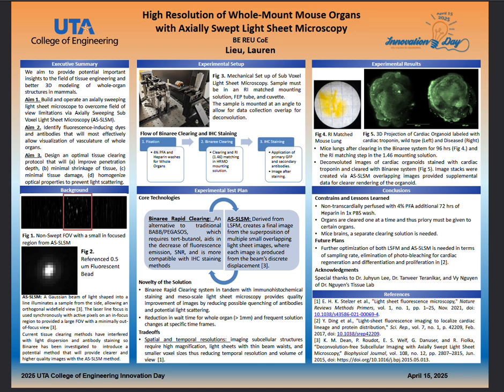Some trade-offs include that when imaging subcellular structures, which need higher magnification, the beams must be thinner, and this reduces temporal resolution and volume of view.